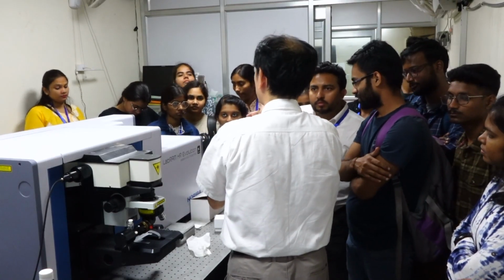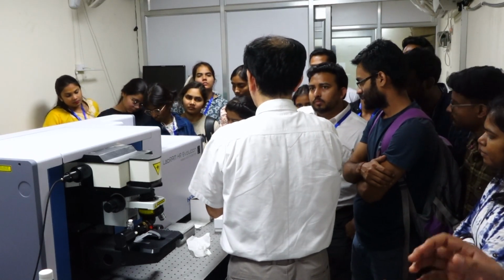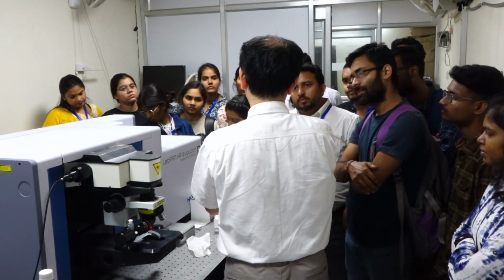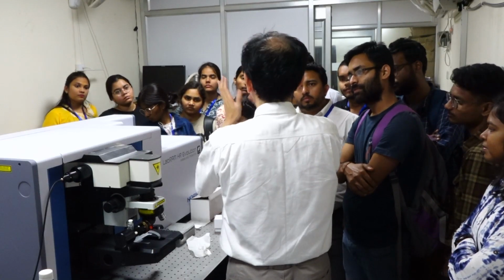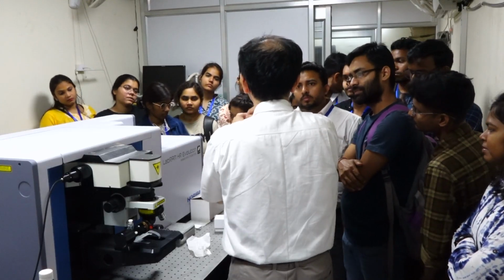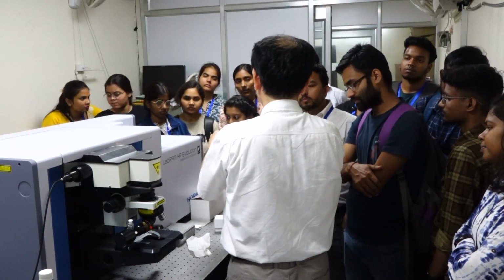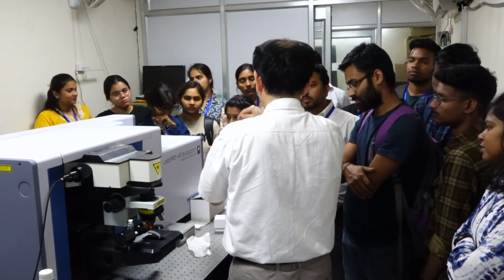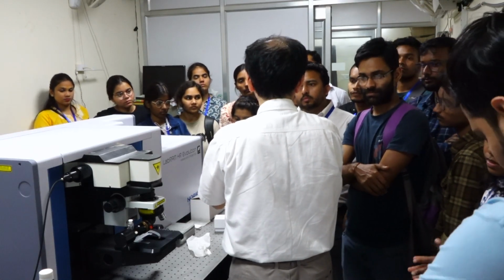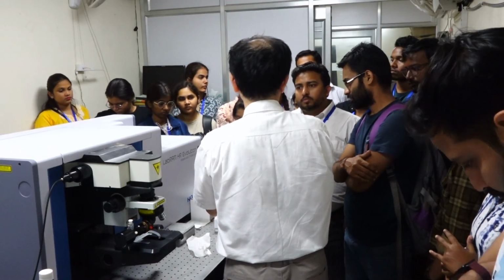Typically we use 100 milliwatts or so for the measurement of organic solvent. But in the case of a living sample, 1 milliwatt, 2 milliwatts, very weak laser power is tightly focused on the living cell. Then we can achieve spatial resolution because the spot is small. So we can scan each point and avoid damage. Reducing the laser power is the one and only method to avoid it.